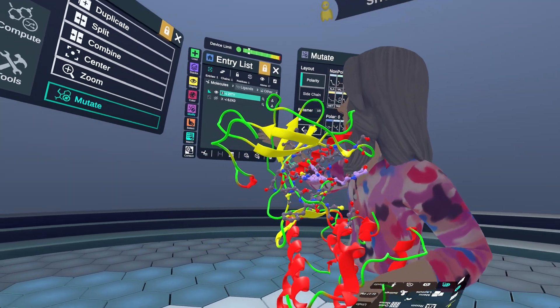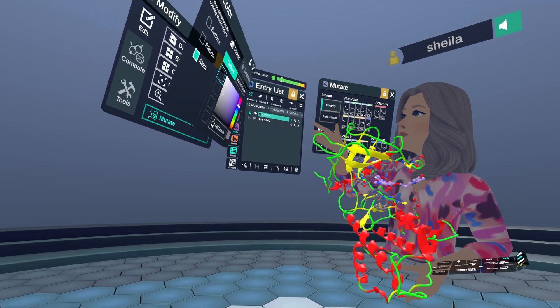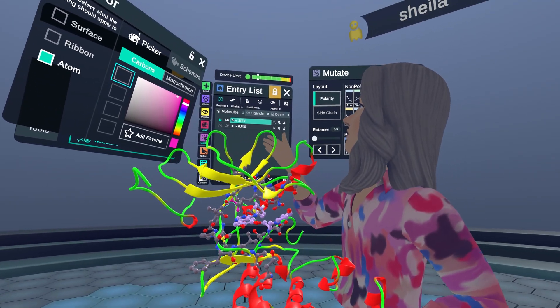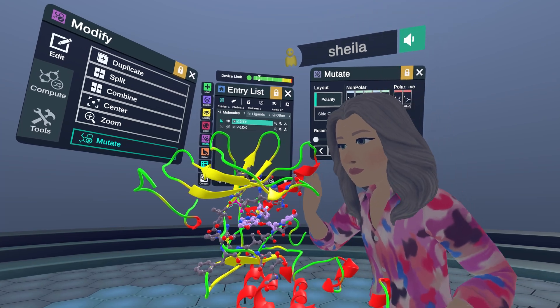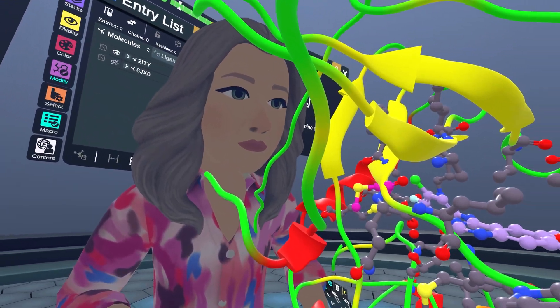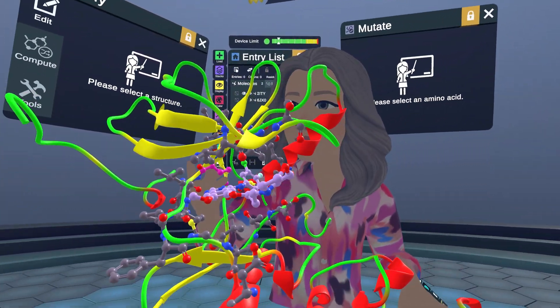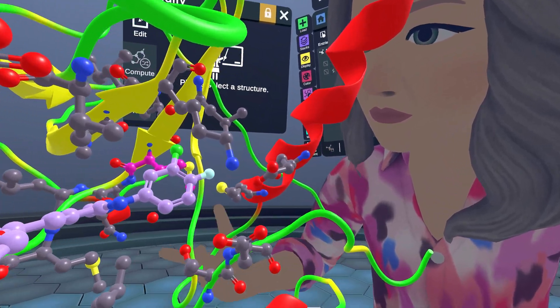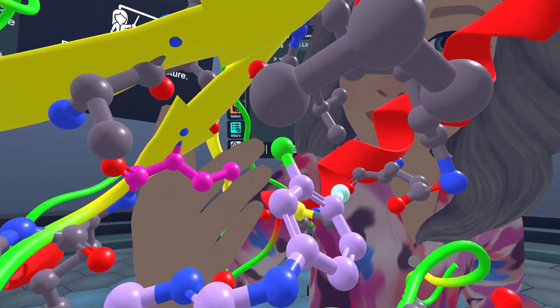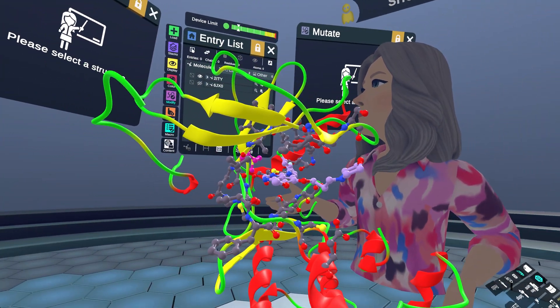I'm going to color the mutant by atom in a bright magenta color so I can find it faster. There it is, modeled in as a mutant. I can tell just looking at this that the thiomethyl group is really close to the end of this beta sheet.